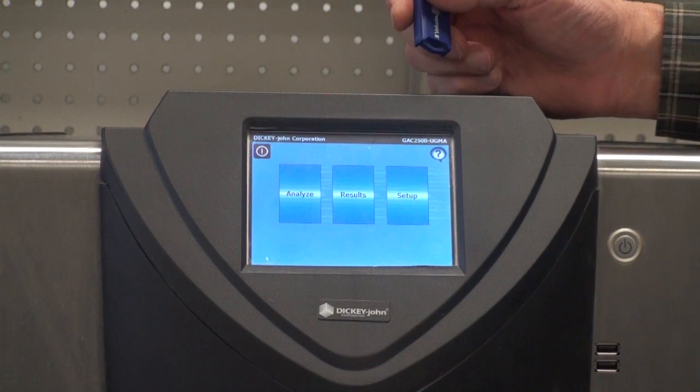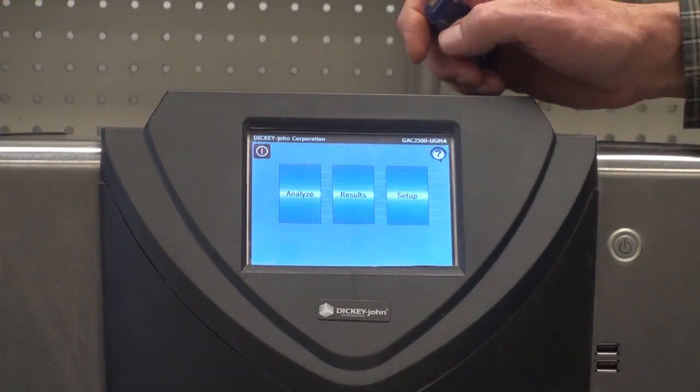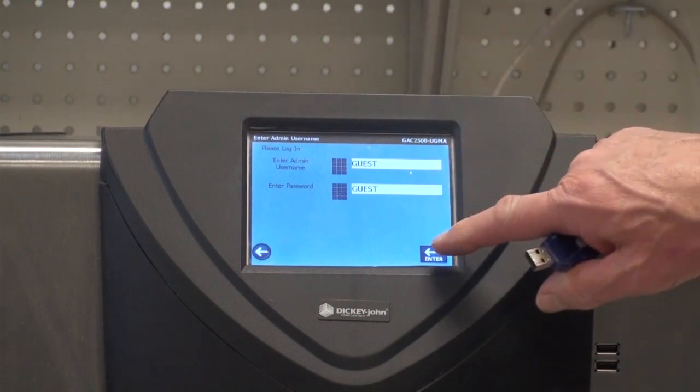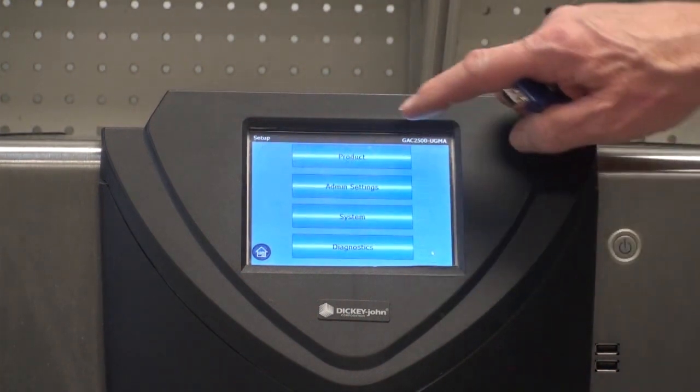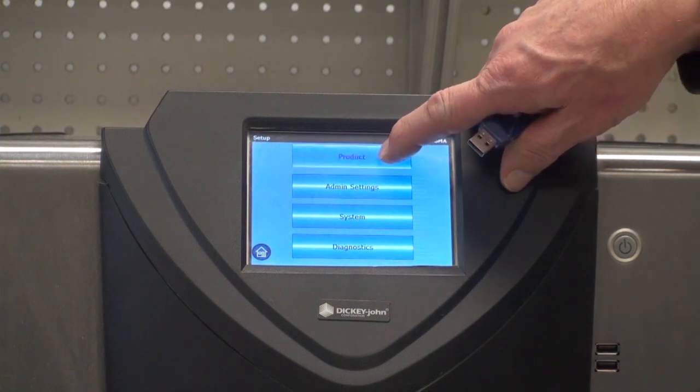To get to the menu to load the products, you would need to press the setup button, go by the password, and you will find a button labeled product — press that.